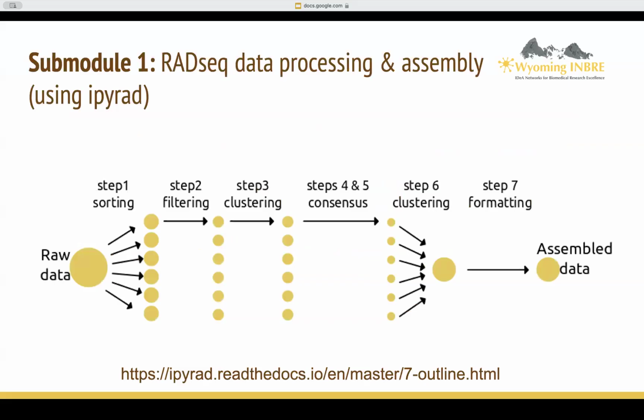We're going to dive into what Ipyrad does to process our RADseq data and assembly. To process RAD or ddRAD data efficiently, especially in our cloud-based environments, we're going to use this pipeline called Ipyrad. You can read more about it at their website if you would like. It is modular, scalable, and well suited to high throughput data with built-in support for RADseq and ddRAD data types.